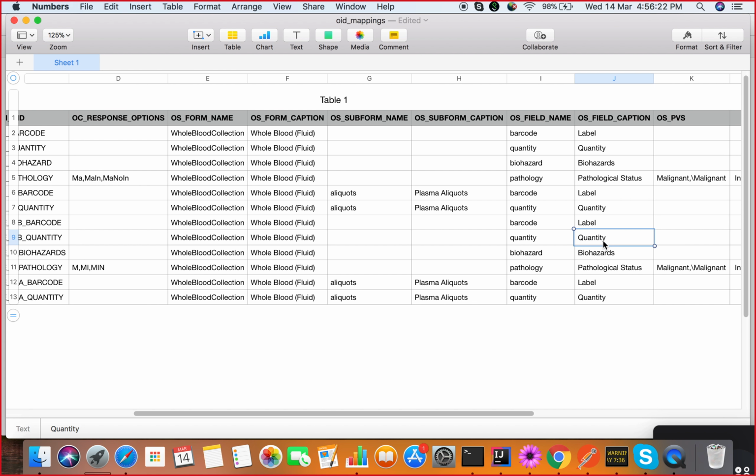So all that will be shortened like this, and this is what will start appearing in the OS UI, and it might not be intuitive to the end user, that is the researcher who is running the query. You got what I'm saying? The field names might be very useful for you as a programmer, but when I use the same field names as the captions, they might not be useful to the end users or the researchers who will be running the queries. Yeah, I understand what you mean.